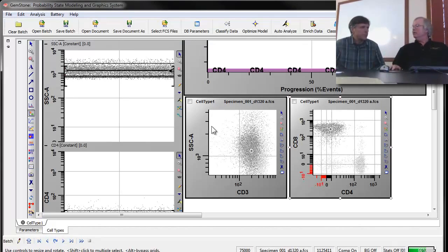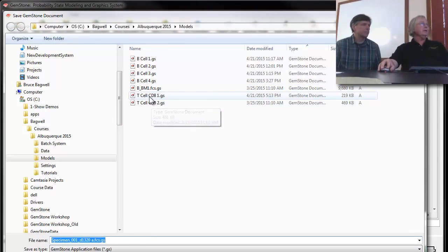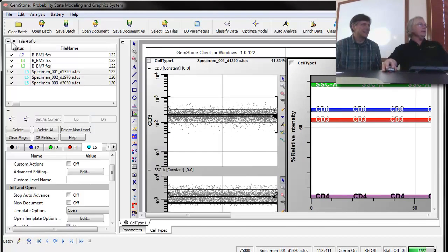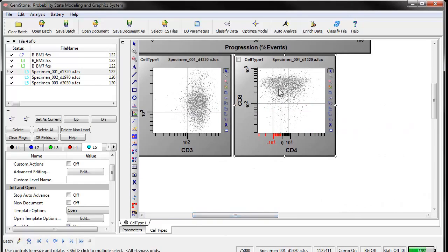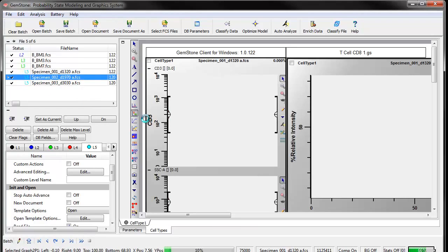That's kind of what happens when you're doing the modeling. You'll maybe forget something, and then all you do is reload the template in, add whatever graphics you want, and off you go. Let's give it a try. It also remembers the scrolling, so I scrolled it back up. And all right, so let's see if it automatically analyzes the first file. Hopefully it will. Okay, and you can see this nice, we're just looking at the CD8 cells, and these dot plots are set up to zoom in right now, Ben. I see. We may want to change that a little bit later on so they're not zoomed in, but for now that's okay. Now let's see how it does with the other donor.